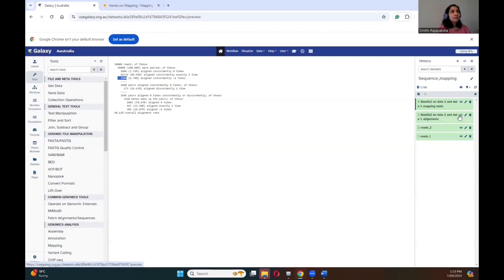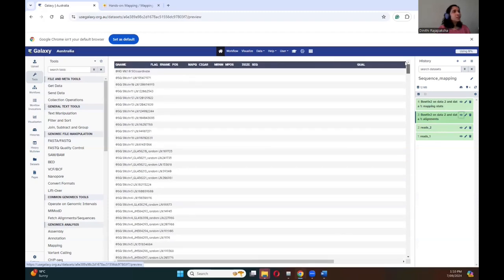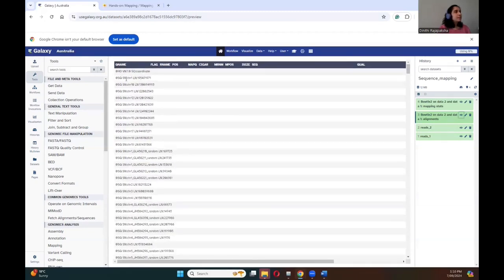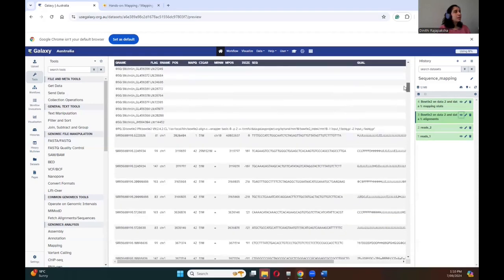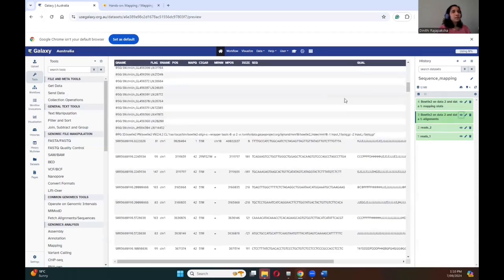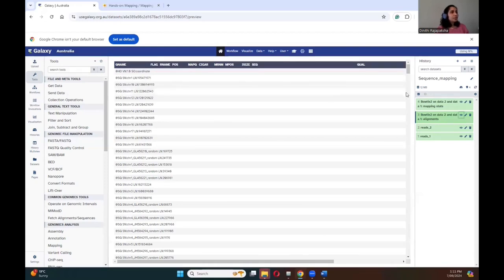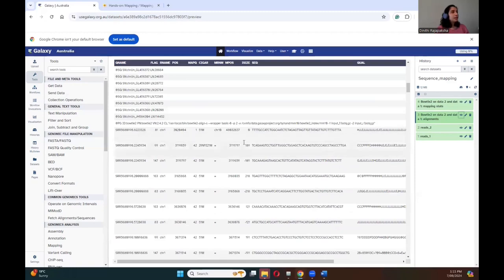Let's move to the alignments file. In the alignment file there are two main sections. All the lines starting with the @ symbol are the header lines, and after that we have the alignments. In the header lines there are different types: @HD, @SQ, and @PG — they provide different kinds of information related to the mapping. The @SQ header lines give information related to the chromosomes or contigs in the reference genome, such as the contig or chromosome name and the respective length.